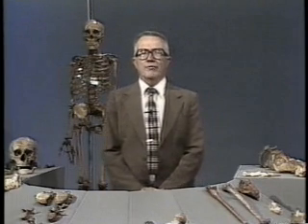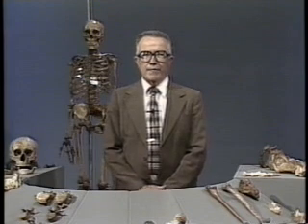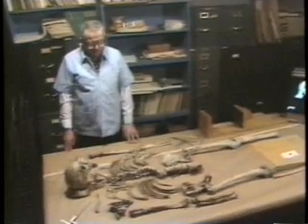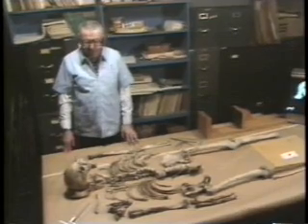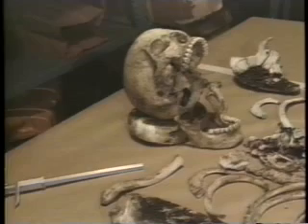I would like to welcome you to the first of a series of 4 lectures dealing with techniques and identification of human skeletal material. I'd like to start off by going to the laboratory and showing the first steps that occur when a skeleton is found by law enforcement agents or by hunters or somebody like this and is brought in to be identified. We have a skeleton here that's just been found out on the edge of the interstate. The police have brought this in and asked us to determine the age, the race, the sex, the stature, handedness, the manner of death, any other thing that we might be able to determine to help identify this unknown individual.